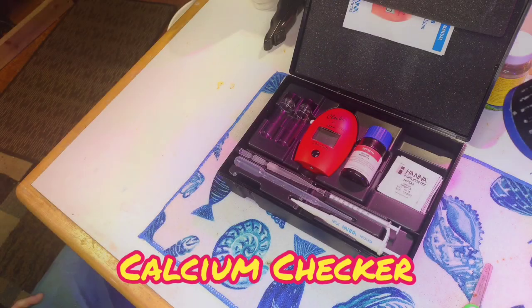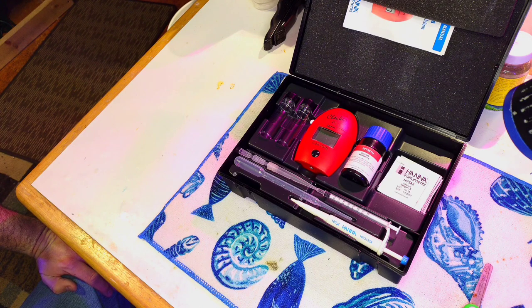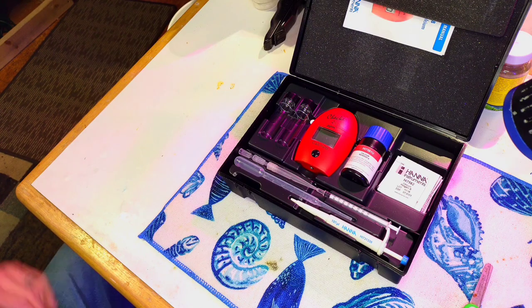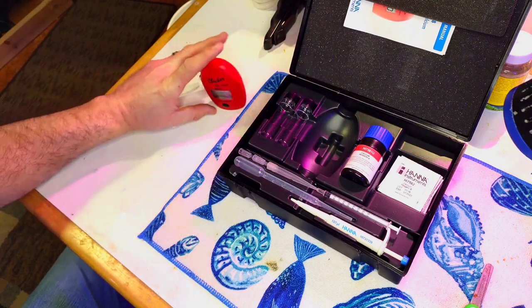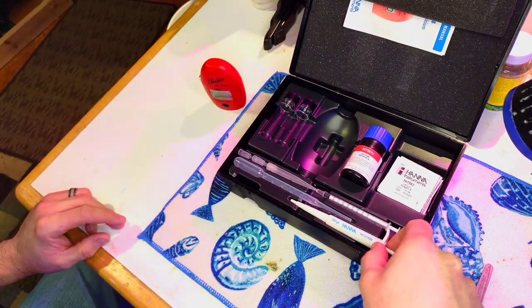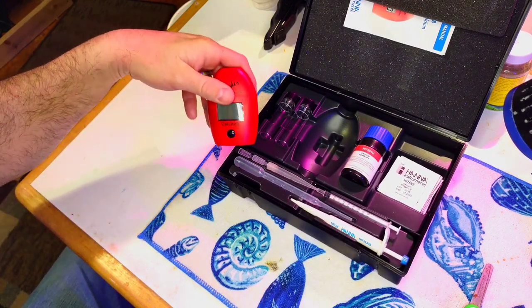Now, this is the calcium checker. When you open it up there's a lot of stuff in there and it looks complicated — it sort of is, but once you do it a couple of times it's not so bad. Some people struggle with this test because it uses a very small sample of water, but we'll break it down and I'll show you how to get repeatable readings.